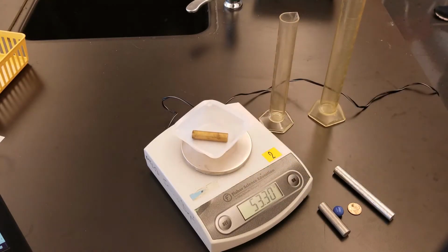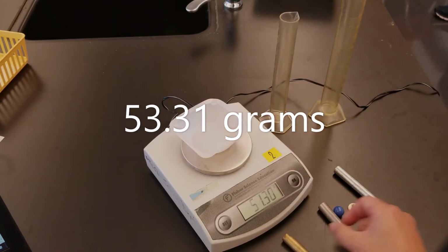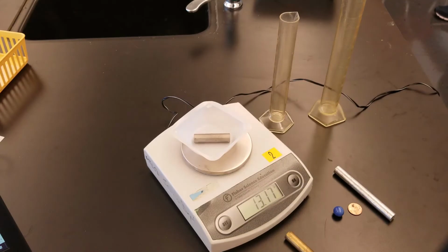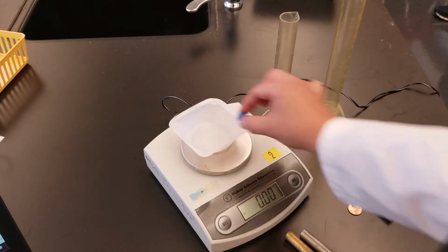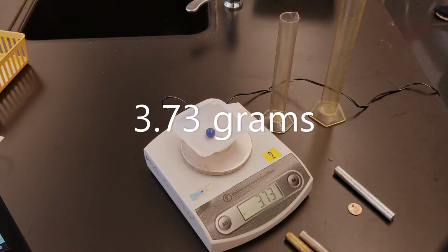Here is the mass of the gold colored 5 centimeter rod. Here is the mass of the silver colored 5 centimeter rod. The mass of the marble.